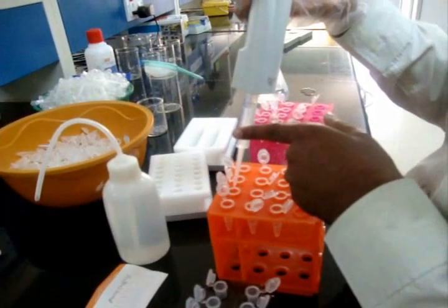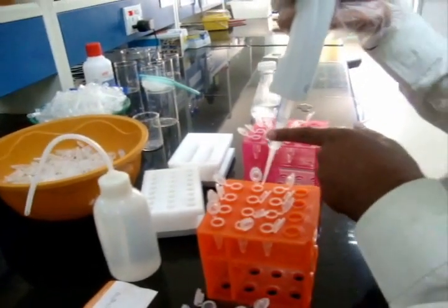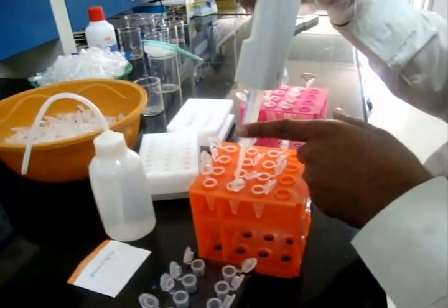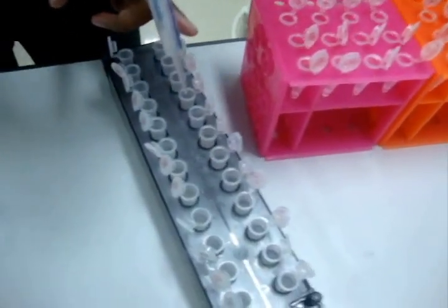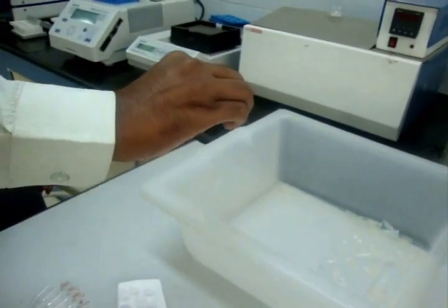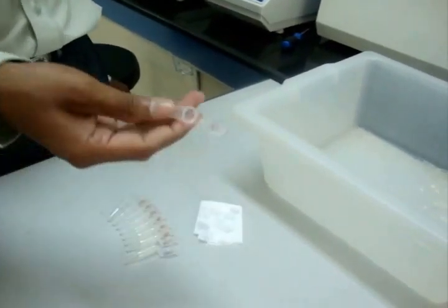Keep it for half an hour. Centrifuge it again at 13,000 RPM for 10 minutes. Decant and wash it with 70% ethanol. Air dry the pellet and dissolve it in 100 µL TE buffer for further analysis.